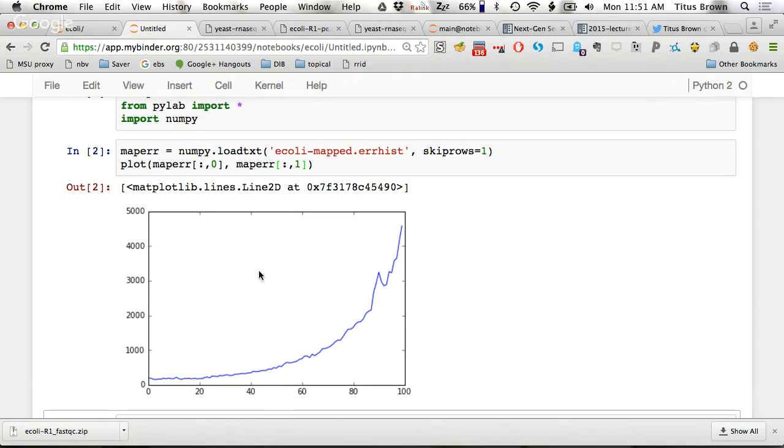You typically do see things like this peak, and this peak is something that I don't know how to explain, but it seems to be generated by the sequencer in some way. Either some reagent or pump malfunction or something, or a technician. My suspicion is always that a technician walked by and kicked the machine. But okay.